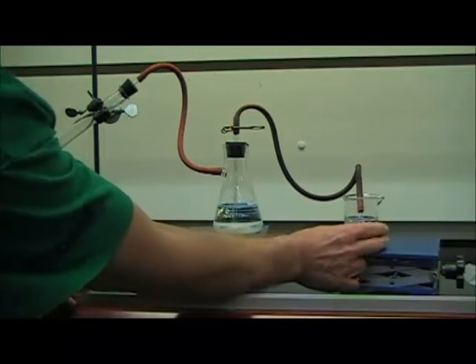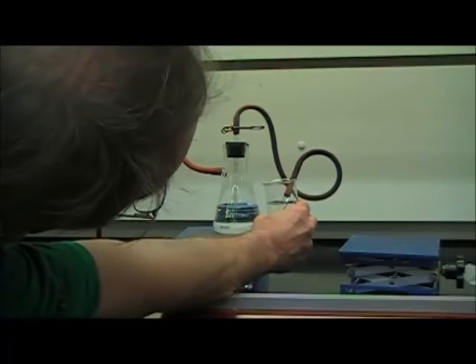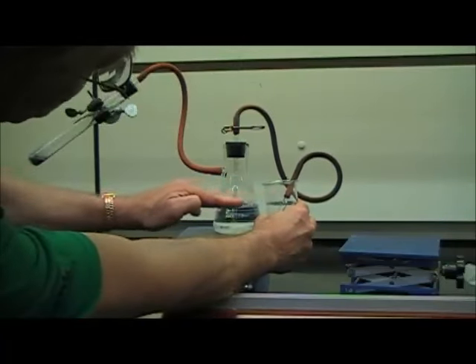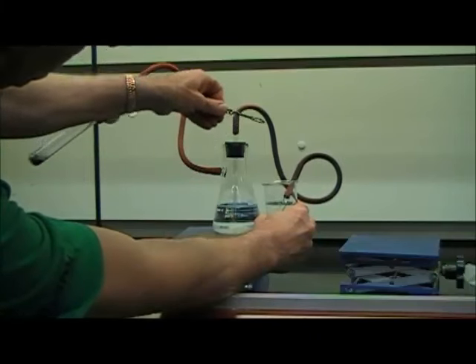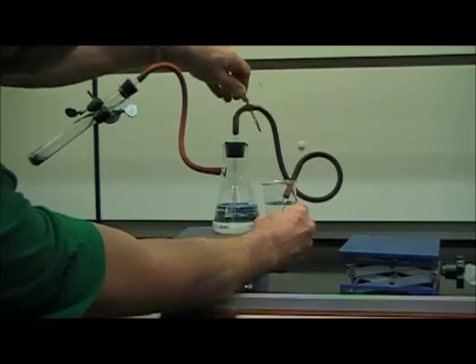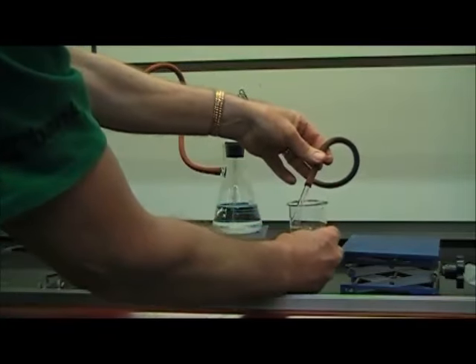So we'll take the beaker and we'll hold it up here next to the flask. Make sure the level on one side is exactly in line with the level on the other side, just like we did before. Now we'll take and close off the water bridge between them. Carefully remove the tube from the beaker and we're done.